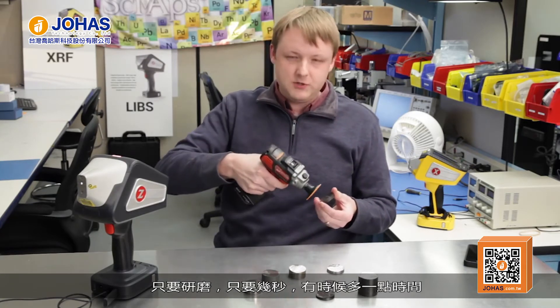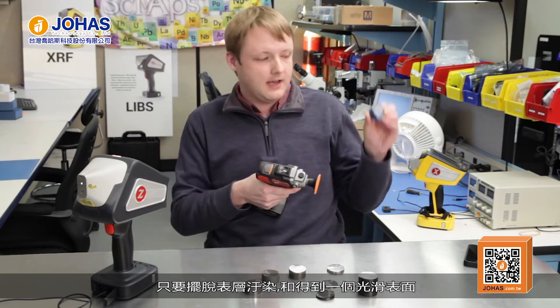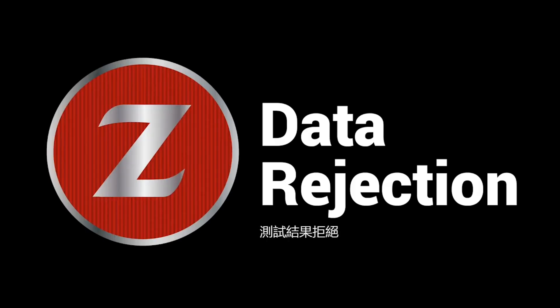For grinding, a couple of different options are available. We've been using a handheld grinder with a ceramic grinding wheel on the front, just grinding for a few seconds — sometimes a little more depending on if you have an oxide or scale layer — just to get rid of any surface contamination and get down to a shiny surface so you can test it with the LIBS. When the software rejects a reading, we think that's generally because it hasn't been properly ground and you still have high carbon contamination on the surface. It can also be due to surface or sample inhomogeneity if you hit an inclusion, but improper grinding is probably one of the biggest reasons you would trigger the data rejection.